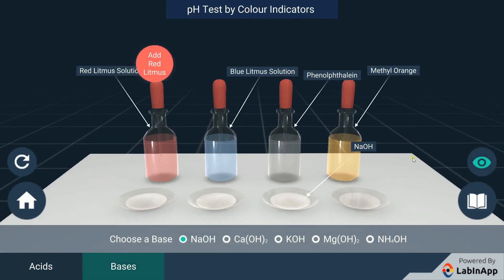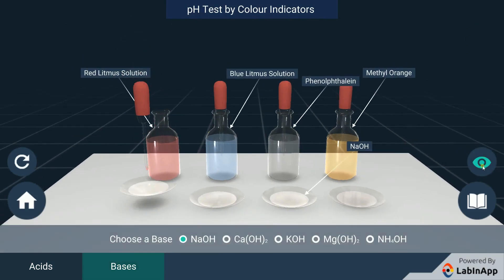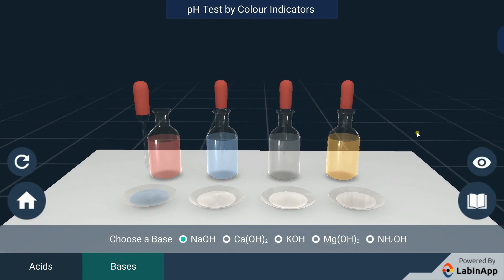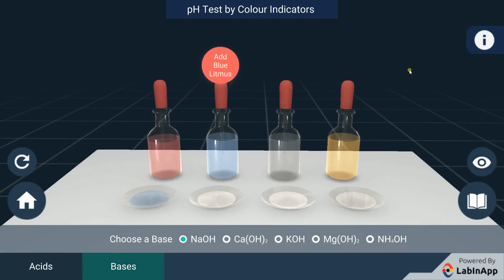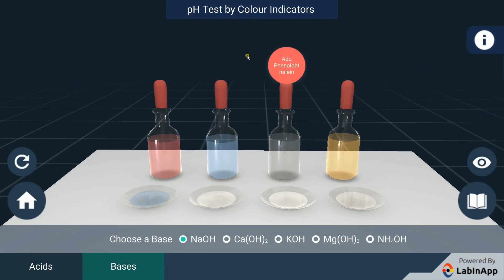Put red litmus solution, blue litmus solution, phenolphthalein and methyl orange indicators in the first, second, third and fourth watch glass respectively, and observe the change in the base solution color.